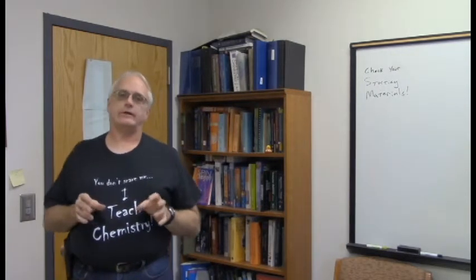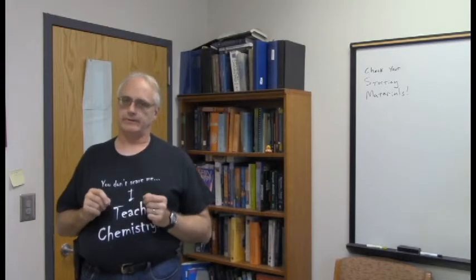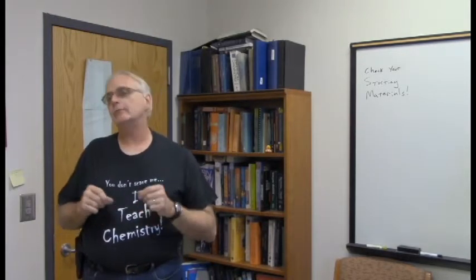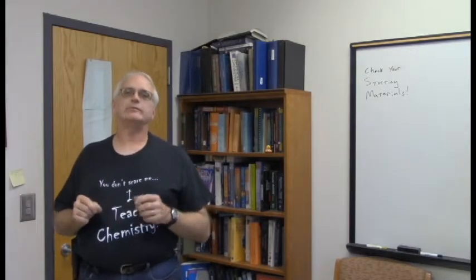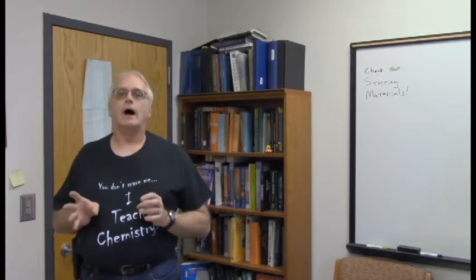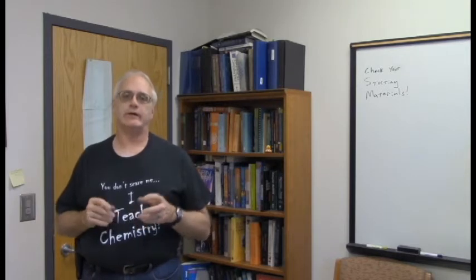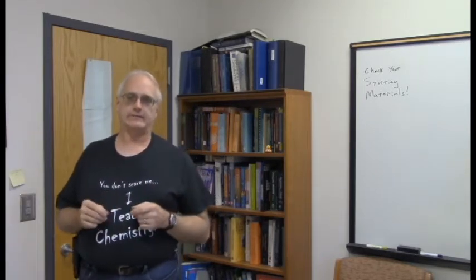A really good illustration of how important that is came from Chemical and Engineering News back in 2012, when they had an article on a chemotherapy reagent called bosutinib. I'm not sure how you pronounce it. I don't really care. But it was a potent chemotherapy agent and the object of a lot of research groups around the world studying this thing.